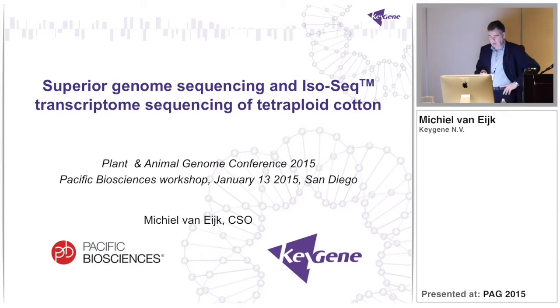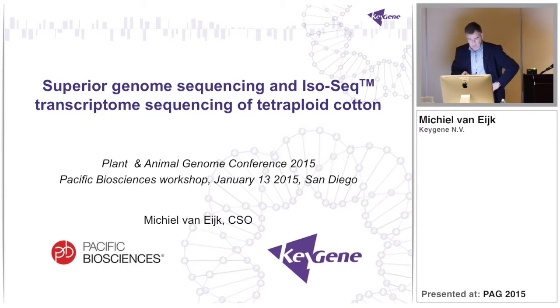Actually, I will be speaking about a collaborative project that is still ongoing between KeyGene and Pacific Biosciences, centered around Iso-Seq transcriptome sequencing in tetraploid cotton, while simultaneously at KeyGene we are engaging in constructing a de novo genome assembly of the tetraploid cotton species.